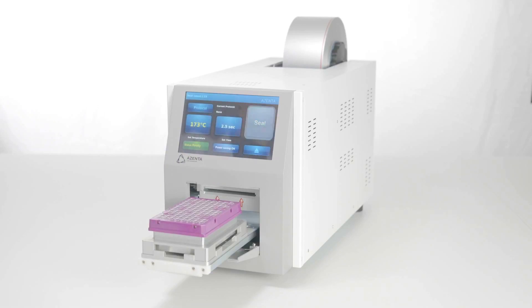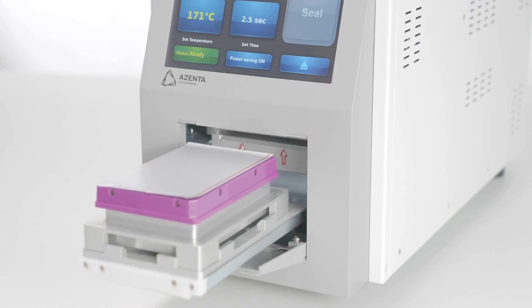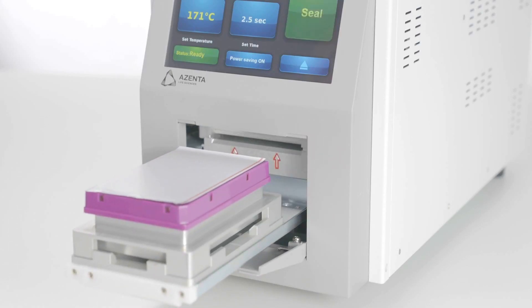Able to accommodate an extensive range of SBS plate types and heights, the instrument is also compatible with any number of sealing materials on rolls of varying width and length.